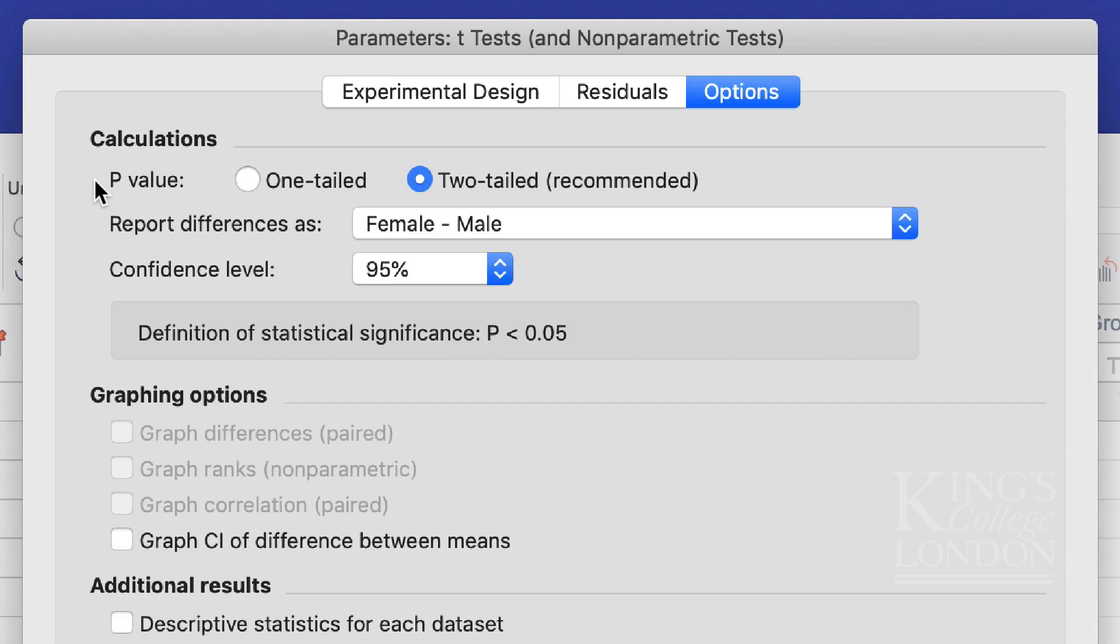This is actually quite important at this point you can choose between a one-tailed or a two-tailed t-test. A one-tailed t-test assumes that your data are only moving in one direction whereas a two-tailed t-test which you can see in parentheses here is recommended is a test that looks to whether the data increases or decreases between the groups.